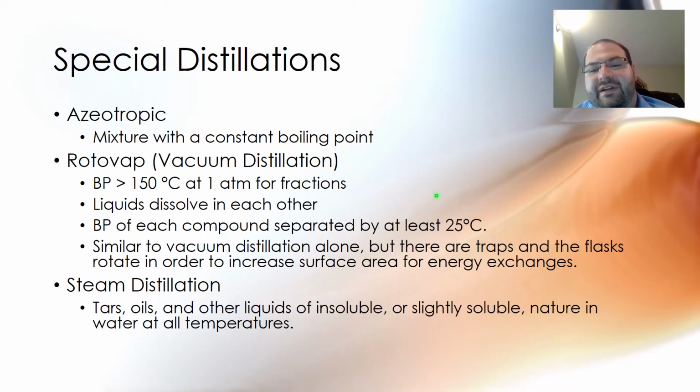You can fit it over a round bottom, and you can put a condenser on the top, and you can reflux it. And you can do that at a nice steady temperature where the temperature stays pretty constant in that system. And you can reflux it the whole night long if you want to, running the condenser on top, and it'll fall back down.